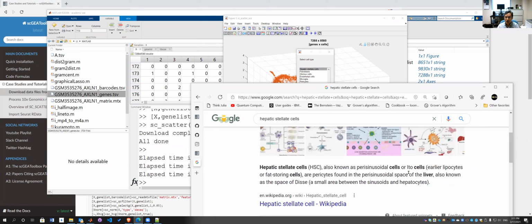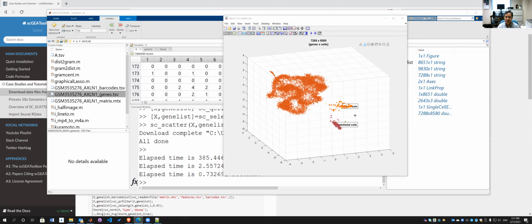Okay, so I don't think our cell is from anything to do with the liver. So I will reject this option. Maybe it's a fibroblast, maybe it's another type of endothelium cell. I don't know. But for now, I just mark it as a fibroblast. Okay, it's close to the more general options.